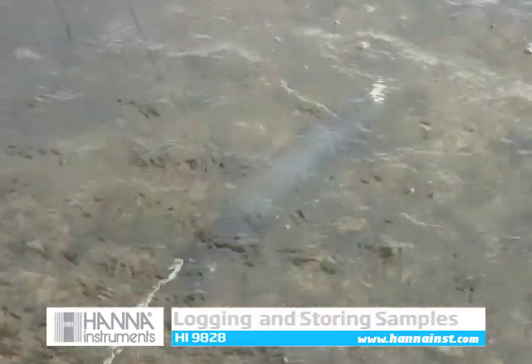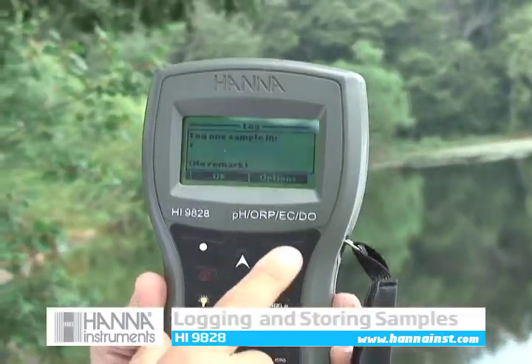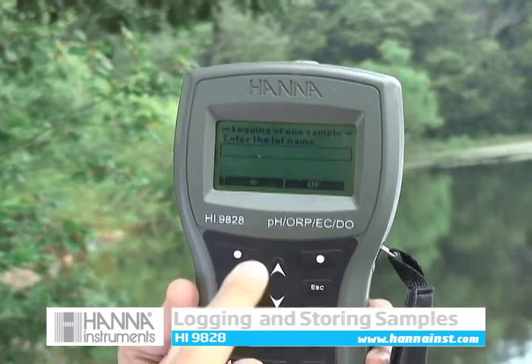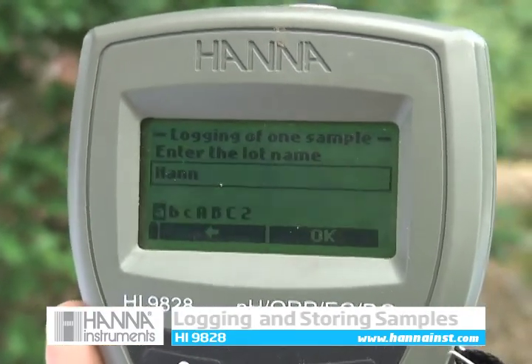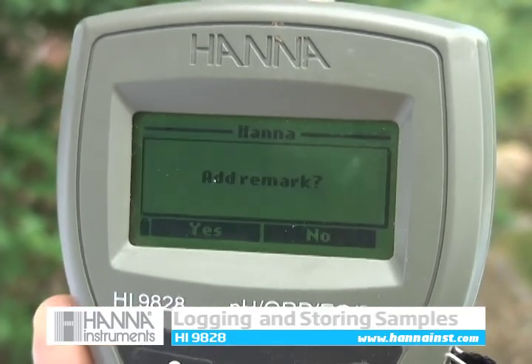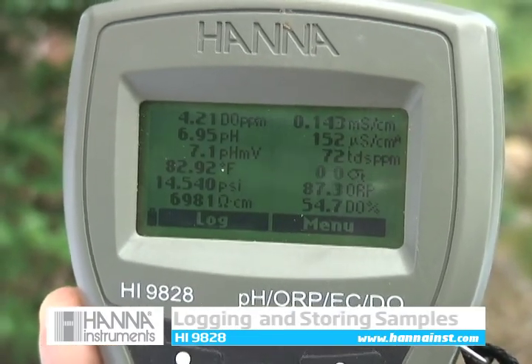The HI9828 has the ability to store up to 60,000 samples in 100 different lots — 48,000 if GPS is enabled. From the measurement mode, press the log key to store enabled readings into the default lot or a custom named lot. Remarks may be added to your log data as well as location information from the fast tracker tag ID system or GPS. Continuous logging can also be chosen with logging intervals between 1 second and 3 hours.